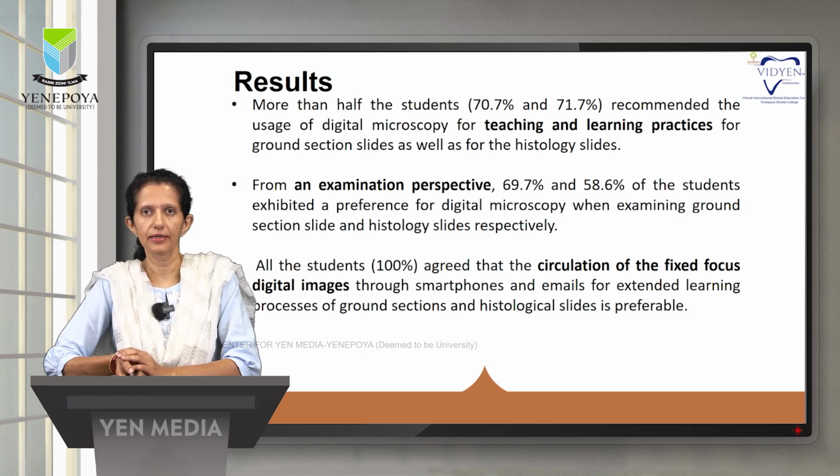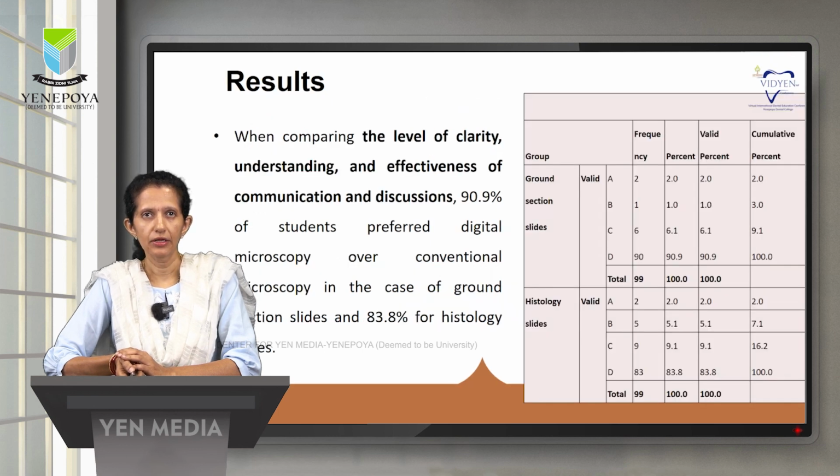All the students agreed that circulation of the fixed focus digital image through smartphones and emails for extended learning processes of ground sections and histological slides is preferable. When comparing the level of clarity of understanding and effectiveness of communication and discussions, 90.9% of the students preferred digital microscopy over conventional microscopy in case of ground section slides and 83.8% for histology slides, and you can see the result in the table.